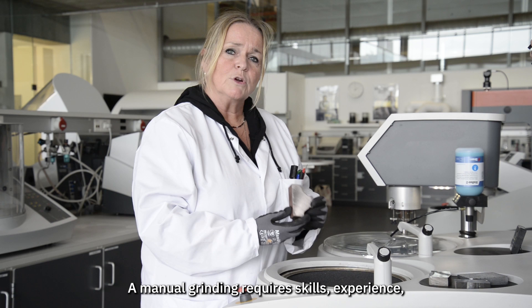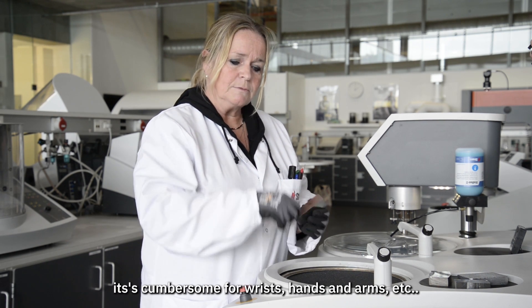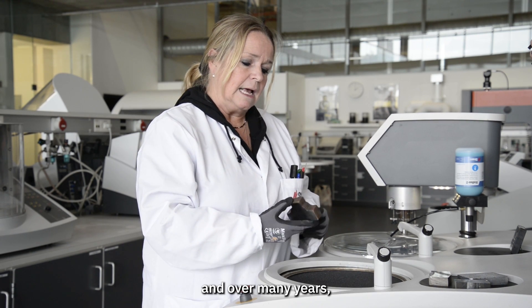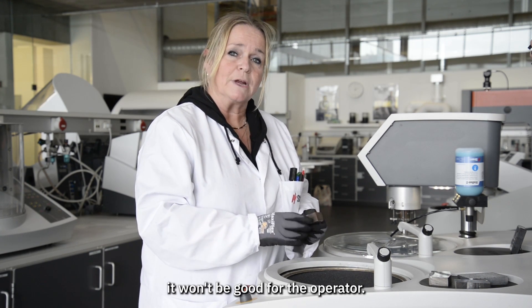Manual grinding requires skills and experience. It's cumbersome for the wrists, hands, and arms, and over many years it will not be good for the operator.